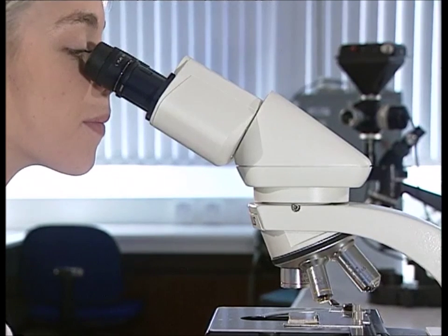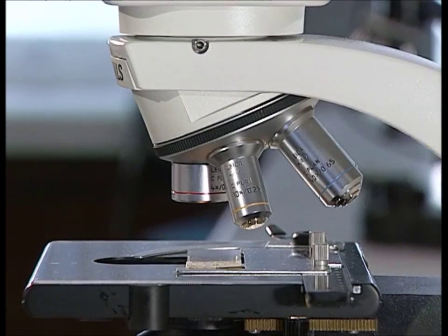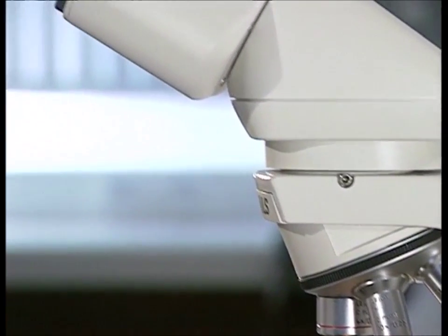The compound microscope gets its name from the fact that the image of the specimen is magnified both by the objective lens and the eyepiece.